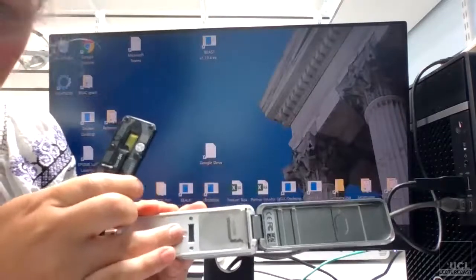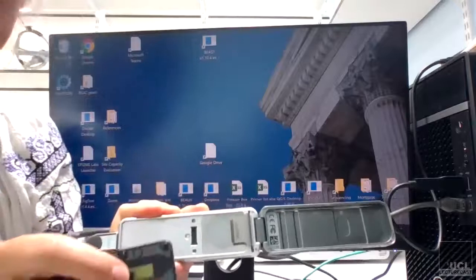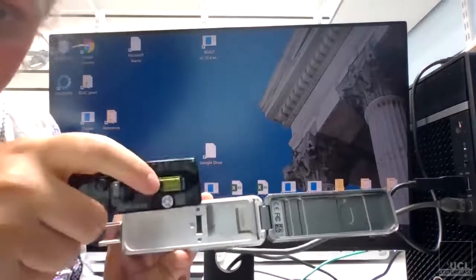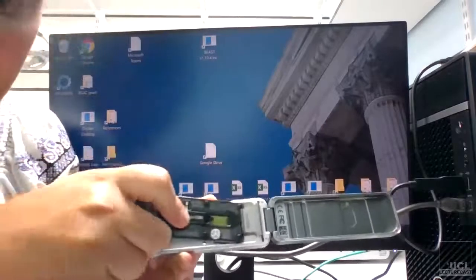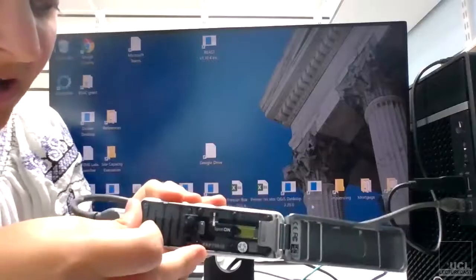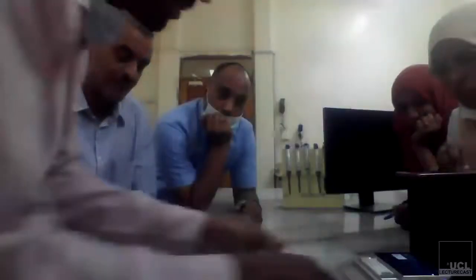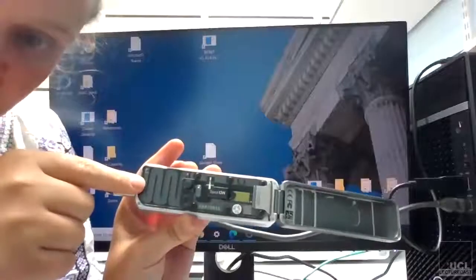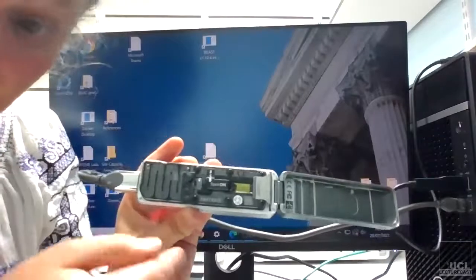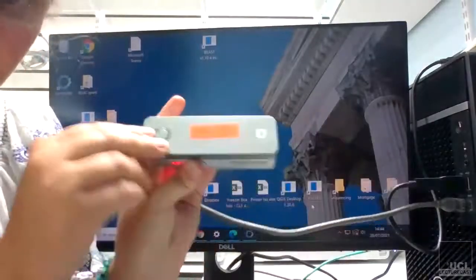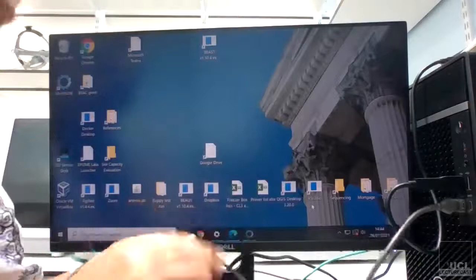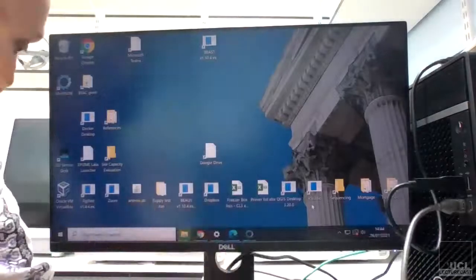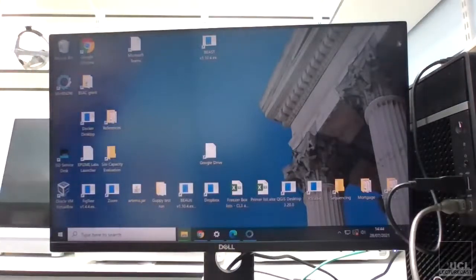The bit where the ASIC panel is goes into the clip, and you should find that then the little bit of the chip will fit into the hole in the MinION. So that's your flow cell loaded. I'm just going to put it down on the desk.